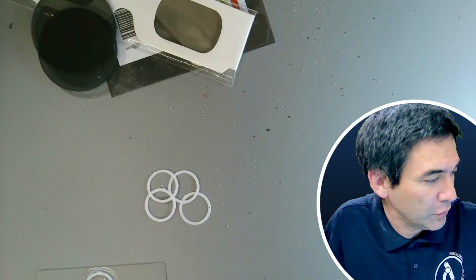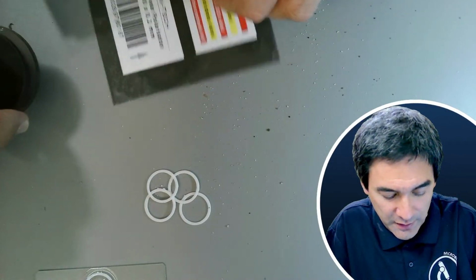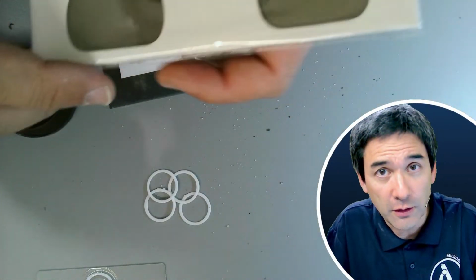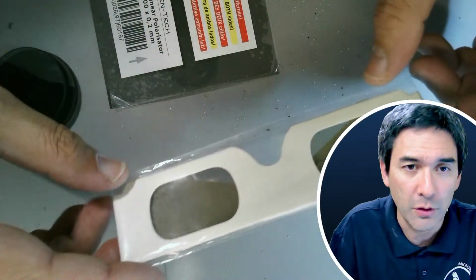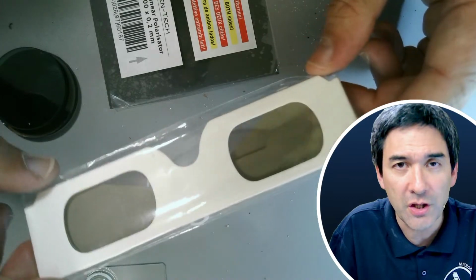No promises that this is going to look good, okay? I just want to illustrate the principle here. Mostly I've been doing microscopy of water microbes and biological things, and why not also look at other things every now and then. Even at the danger of repeating myself, but maybe some of you are new and have not seen this yet, they are cheap, those 3D glasses.